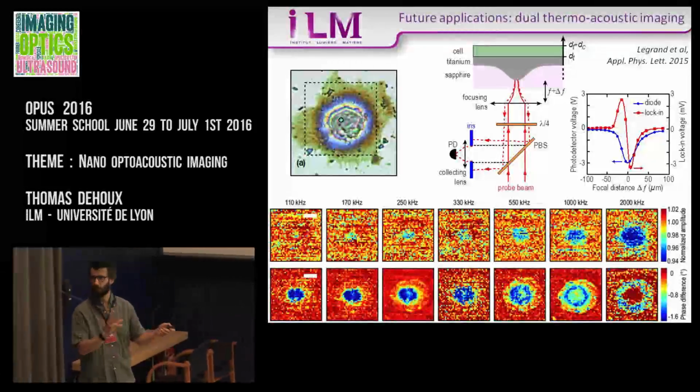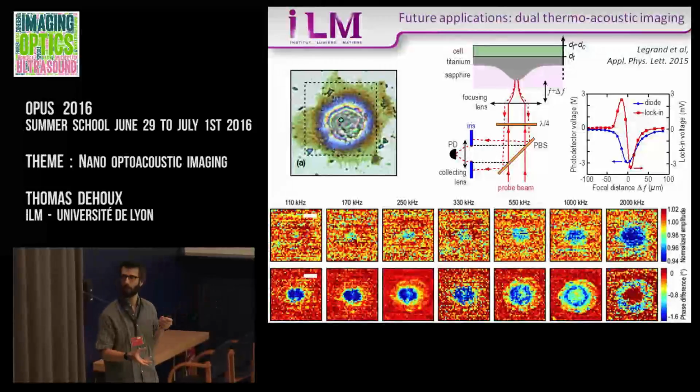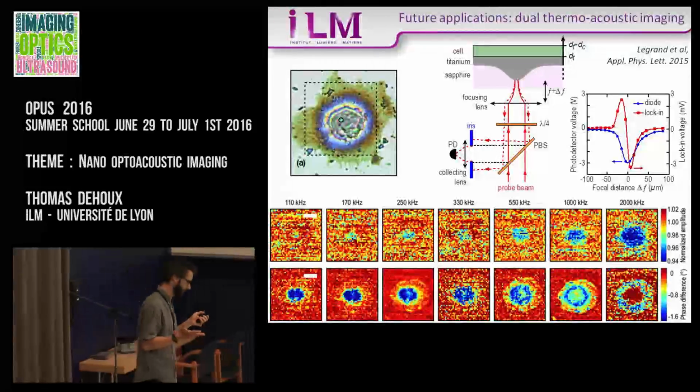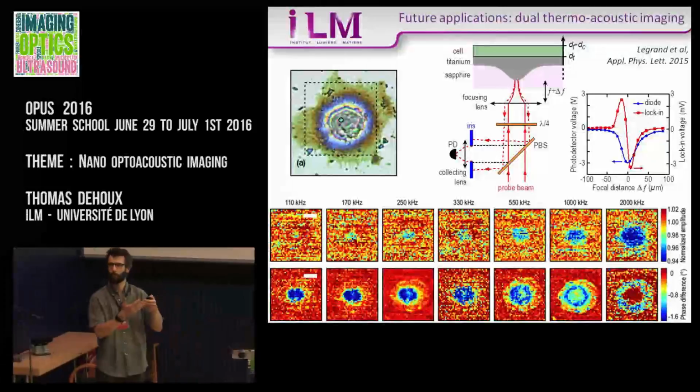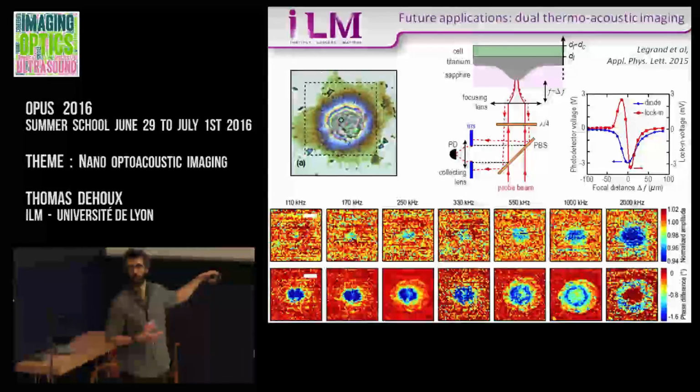we didn't talk too much about the ability of this setup to probe the thermal fluctuations, but this is also something we can do because we are heating the sample. So if we're able to record the temperature inside the metal film, we might be able to sense how much heat is absorbed by the cell, which is on the other side.